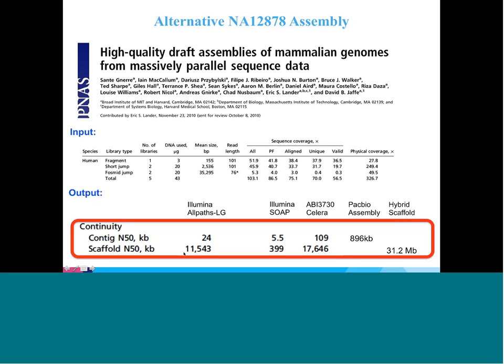And one thing I want to point out is this 11.5 megabases, this covered also 91% of the genome, so we're almost one-to-one on what we're covering on the genome. So it's not that they covered way more of the genome than we did. I'd say this is not quite an apples-to-apples comparison because of the short read sequence quality, which I'll get into at the very end, but it's about as close as I think we can get with current technologies. And this used, again, cloning libraries with plasmids.